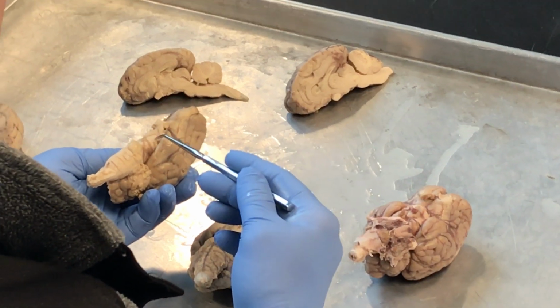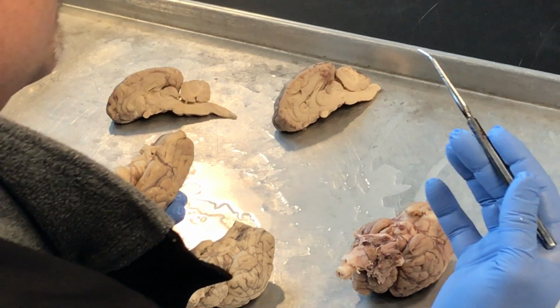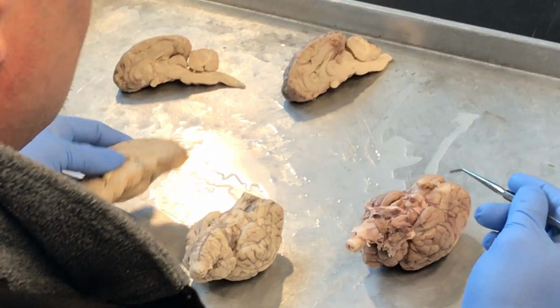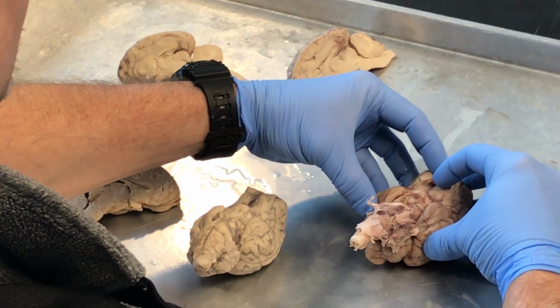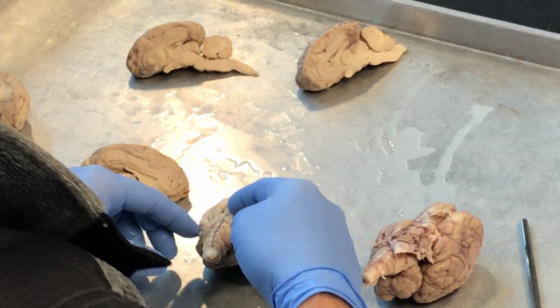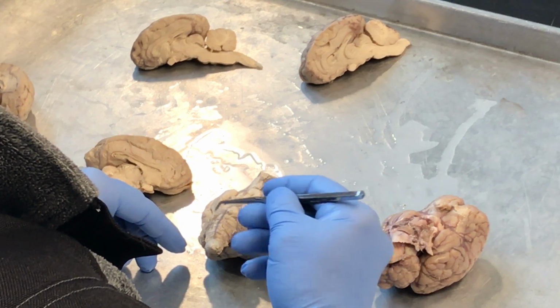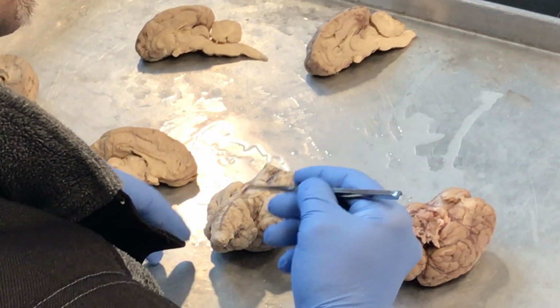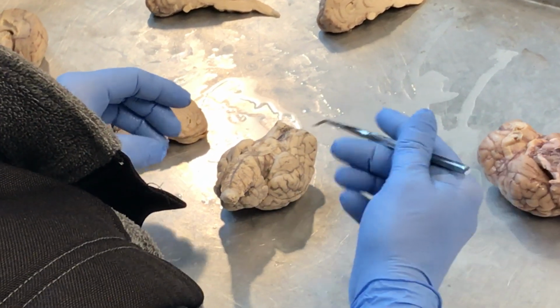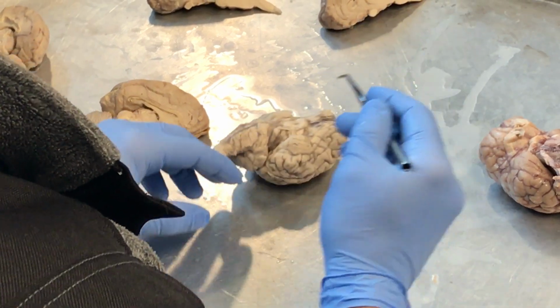But what you'll notice is this cerebral peduncle is the front part of what we call the midbrain. Now the midbrain is part of the brain stem. So this here is cerebrum, this back here is cerebellum, and then all this area down to here is all part of the brain stem, because it's the stem of the brain. It would still be part of what would kind of look like that stalk that we talked about. But let's divide the brain stem up if we could.